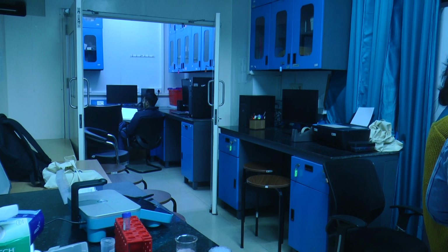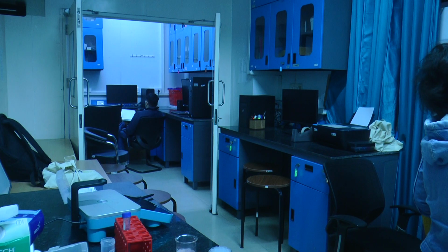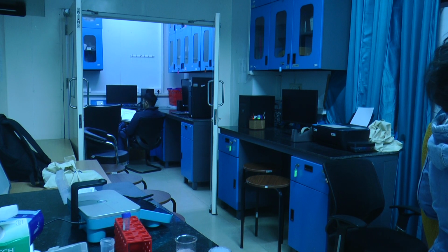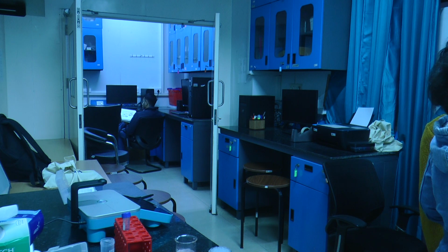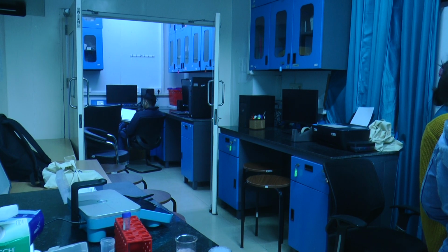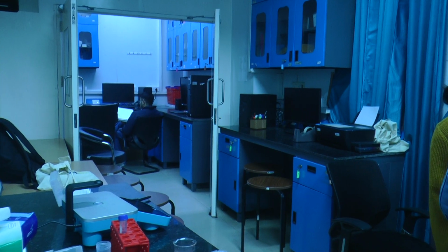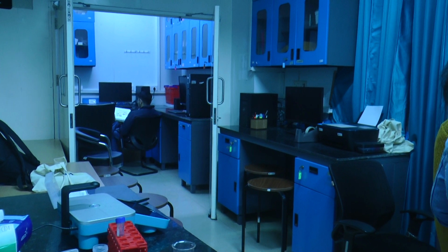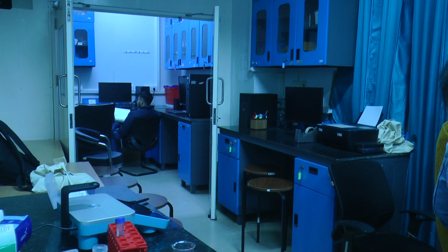So you're not interested in a very particular component of lipid? Not yet. Okay, you're interested in general. Right now, our first step. This is an initial research, so it is the first step to see how they behave in different environments. So I have picked up this component, which is safe for me to change. With this, I changed the osmolarity by 50 millimolar, then again 50 millimolar, then again 50 millimolar. So 2-3 times I have increased this.